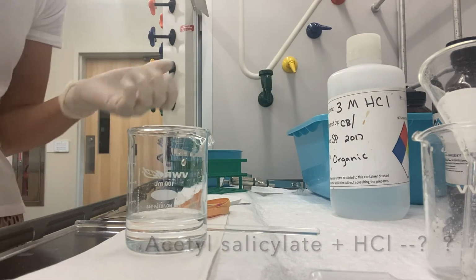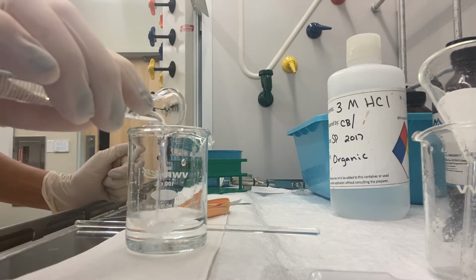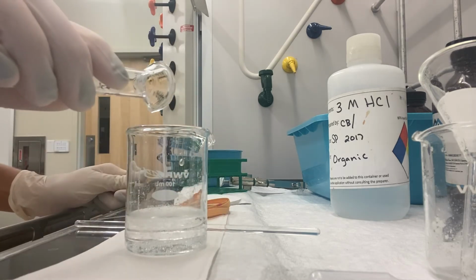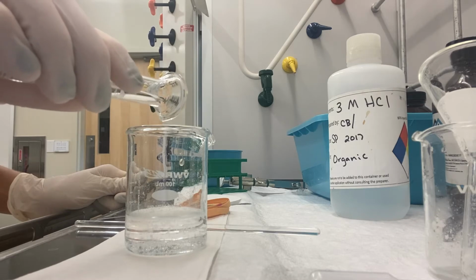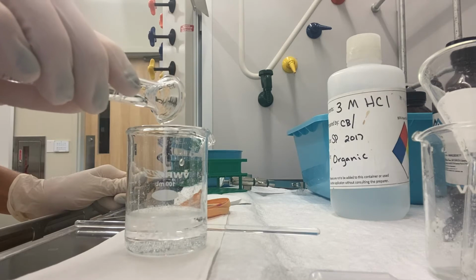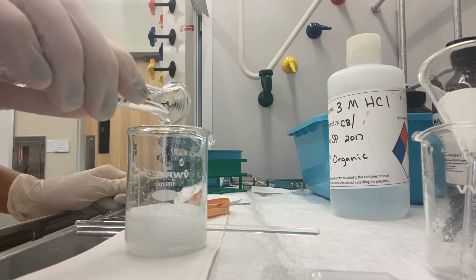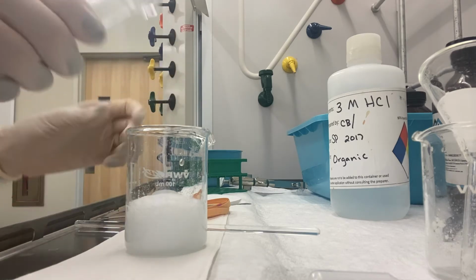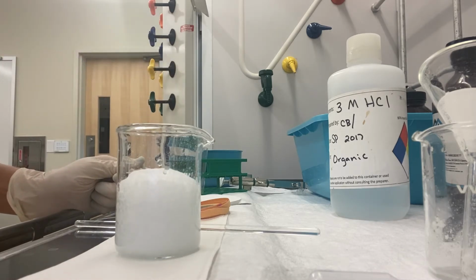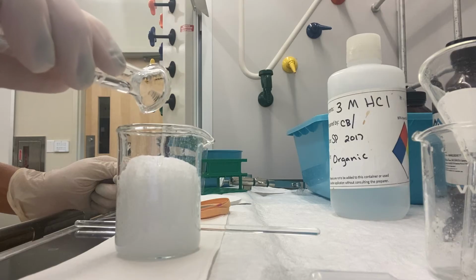So we're going to slowly add it. We know that acid-base reactions can be vigorous, so we want to be kind of careful about it. See, we already have lots of bubbling and fizzing. And when you protonate sodium bicarbonate, think about what kind of gas we're forming, which is coming off of this. What is that?